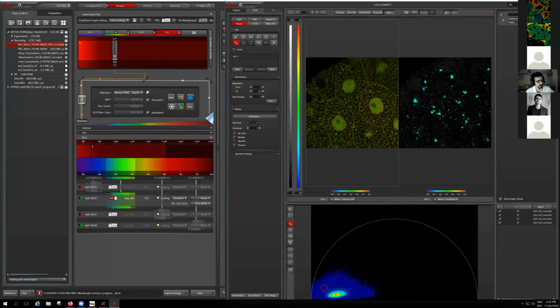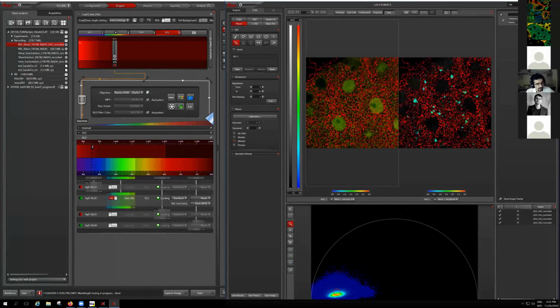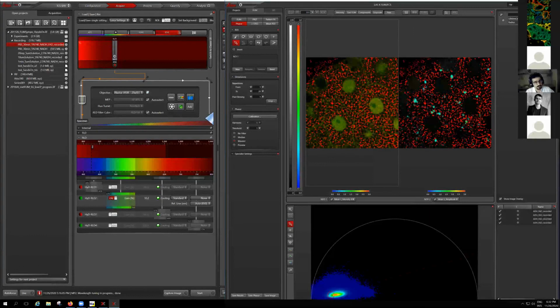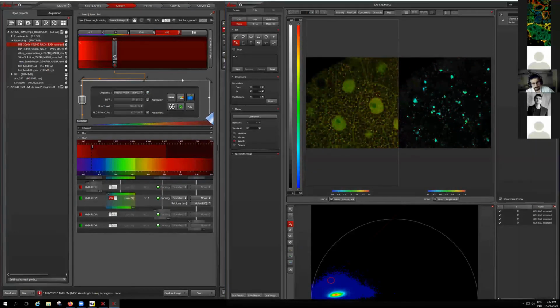So we need to calibrate our phasor here, and I don't have the data for that. But the distribution is showing two of them, and then we can just remove this one. So I need to find the names, which one is which.